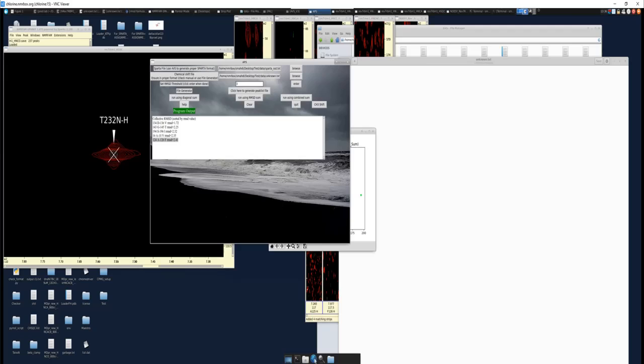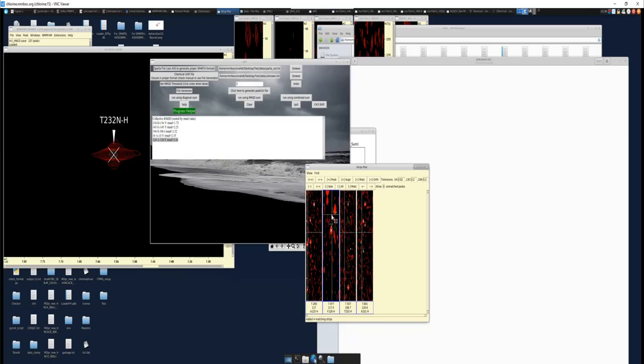And we can see that the RMSD of that alanine-alanine pair, which was 124, 125, has now shot up to an RMSD of 2.41, right? So this strip here that gave us an RMSD of 1.54 is a much better match than this strip here that gave us 2.41. So we can use Sparta Plus in this way to actually get rid of this, right?